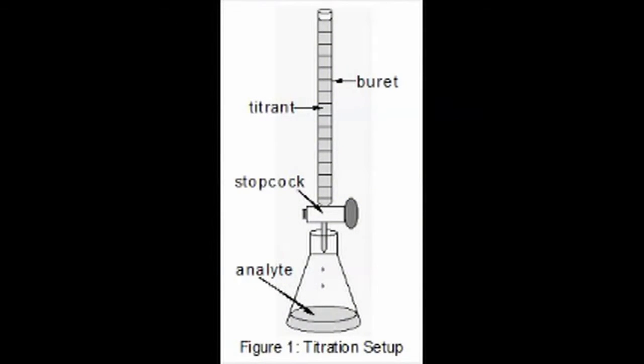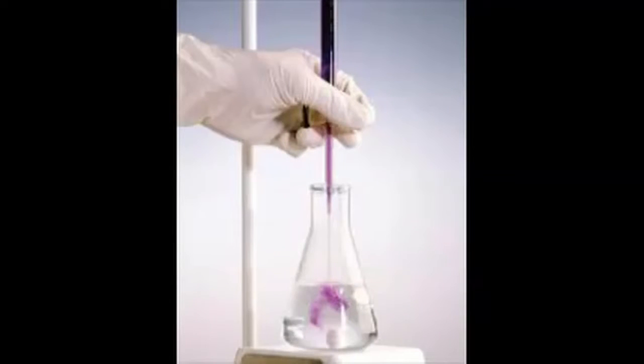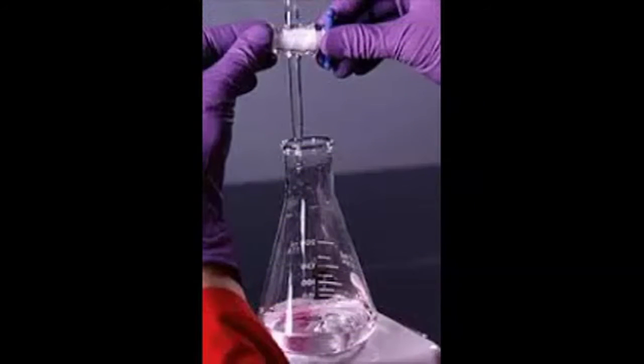Titration is a process where a base is added to a solution of an acid and an indicator. The indicator allows a solution to change color. Adding a large amount of base can affect your concentration. When mixing the base and acid, the indicator creates a pale pink color.